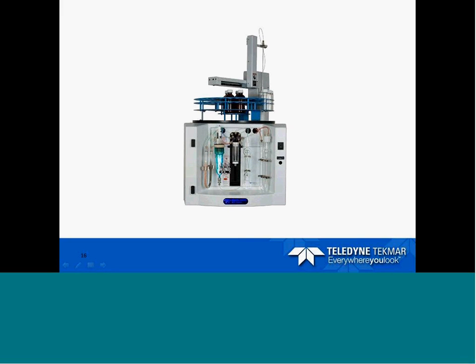This is our UV oxidation reactor. This is where the persulfate combined with the UV light is going to oxidize all the carbon in the sample.